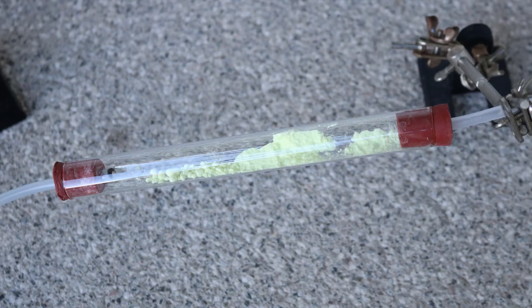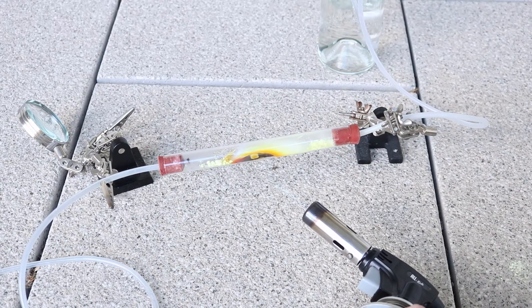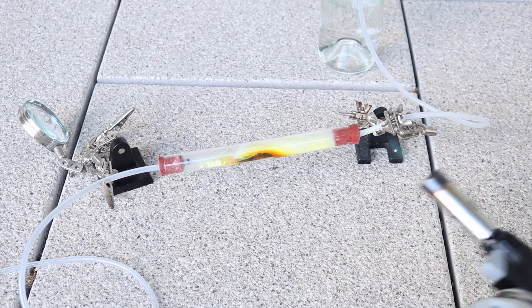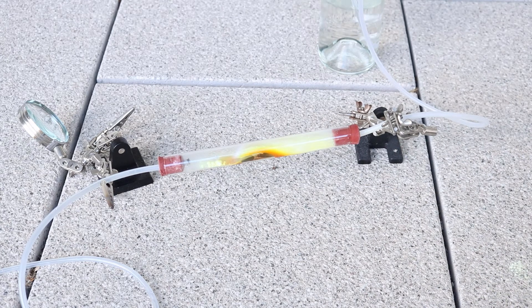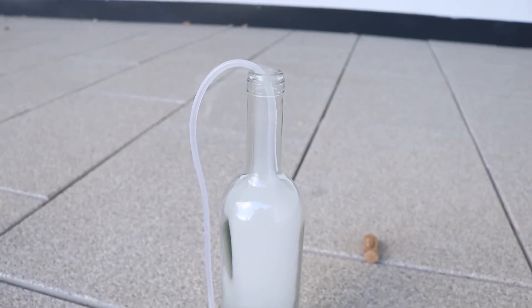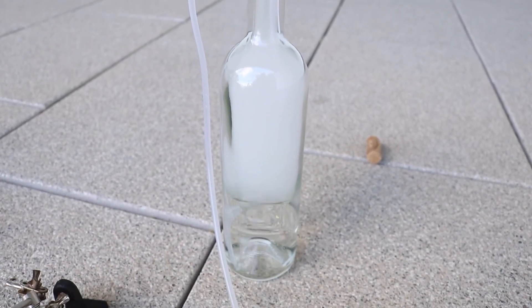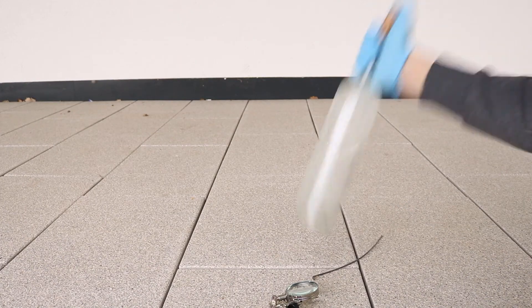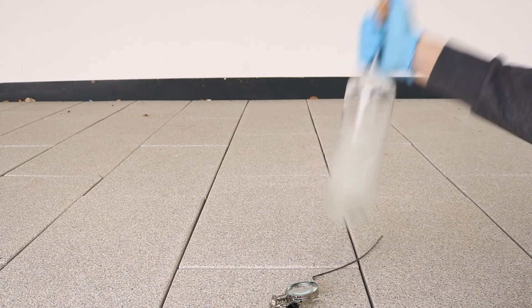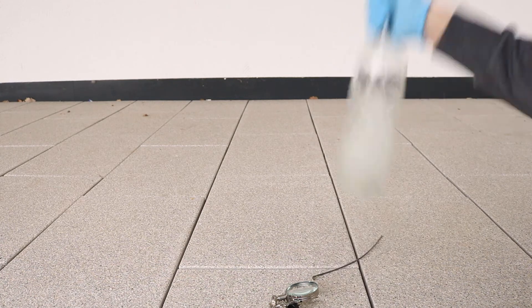I then put sulfur into the tube and heated it up. It can be a bit slow to start, and I had the problem that the sulfur was just vaporizing instead of burning, and it clogged up the tube. But after a bit the sulfur starts burning and the bottle fills with the white gas. Just bubbling it wasn't working too well, so I shook the bottle every time it was full of gas, until all the sulfur burned away.